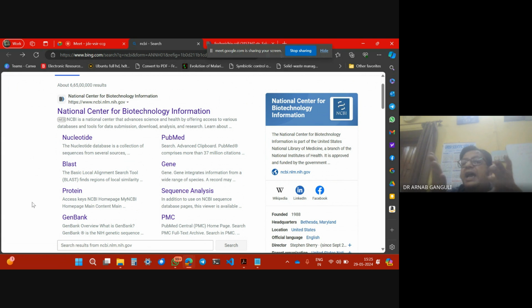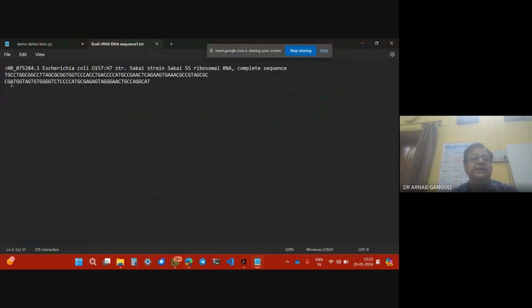In this case, we have a known DNA sequence, but you have an unknown DNA sequence. So what are you going to do with this unknown DNA sequence? Say for example, here you don't know what this particular sequence is. Okay, you have this accession number. You need to do BLAST.